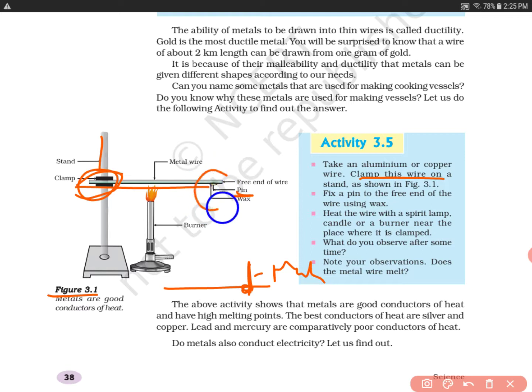Now we need to heat the wire with a spirit lamp, candle, or a burner near the place where it is clamped. Where you have clamped this side, we will heat up the end of the wire. What do you observe after some time? Note your observation. Does the metal wire melt?